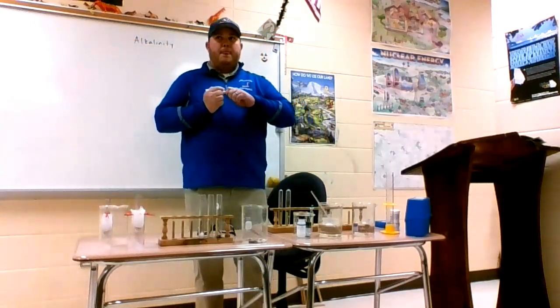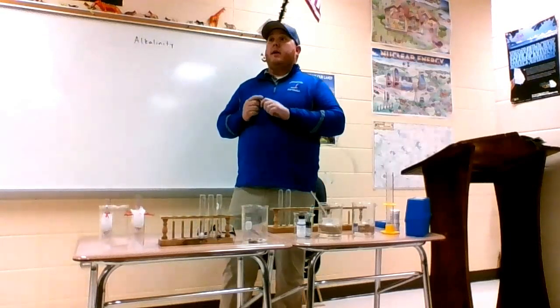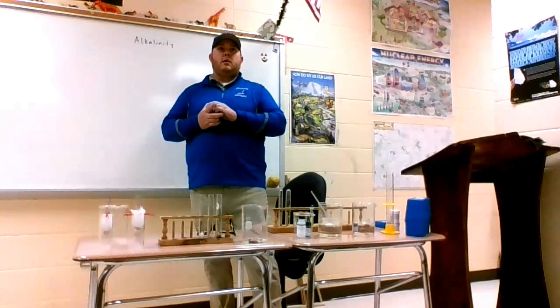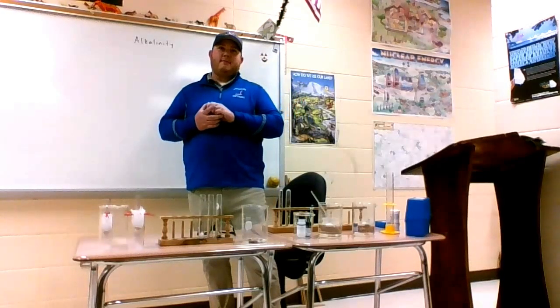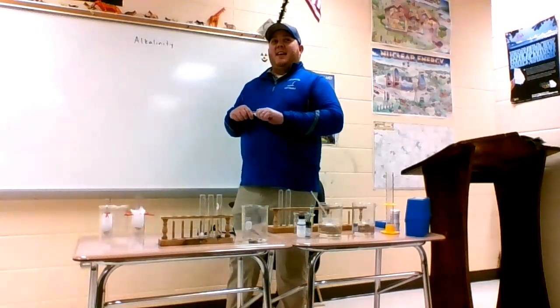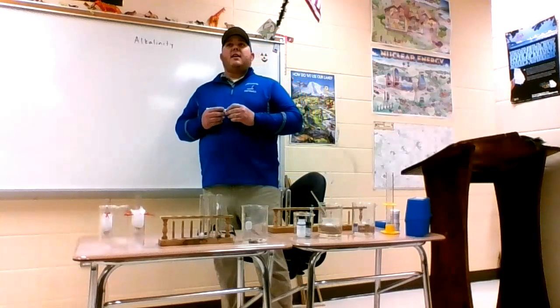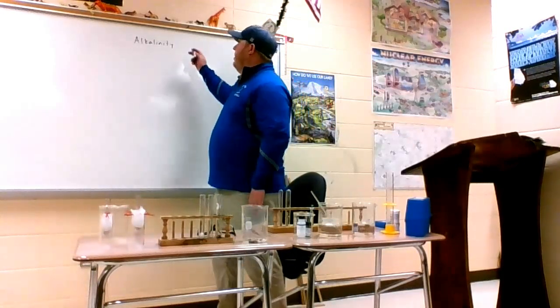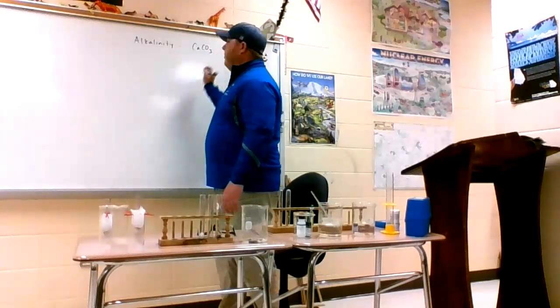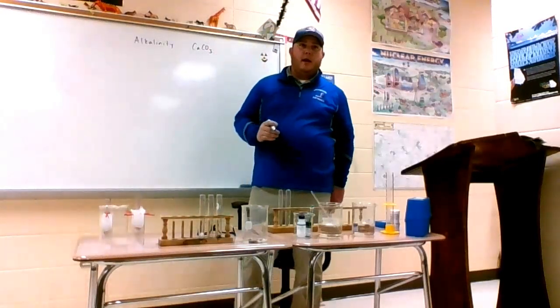Alkalinity is what? Should we be writing this? No, because it's in here. The measure of alkaline solids? Yeah, it's a measure. Okay. You got that part. But isn't that like a characteristic of some kind of element? Well, it's measured in parts per million of calcium carbonate.